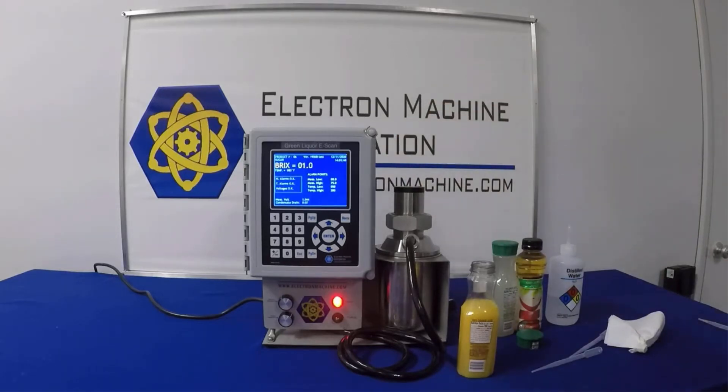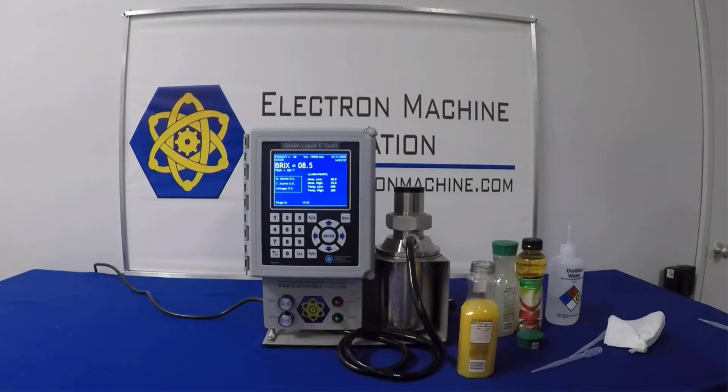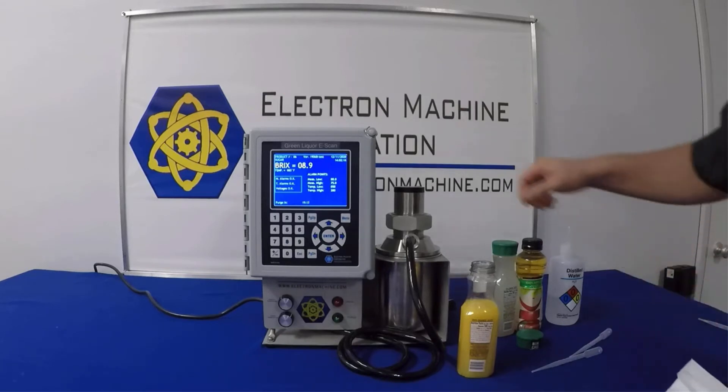You have to give it a minute to stabilize — we just flooded the sensor with a lot of light. Normally this instrument would be installed in the side of a pipeline. This looks like it has a sugar content of around eight to nine Brix. That's a standard term. Maybe nine Brix is where it stabilizes. We'll clean it off and go to the lemonade.